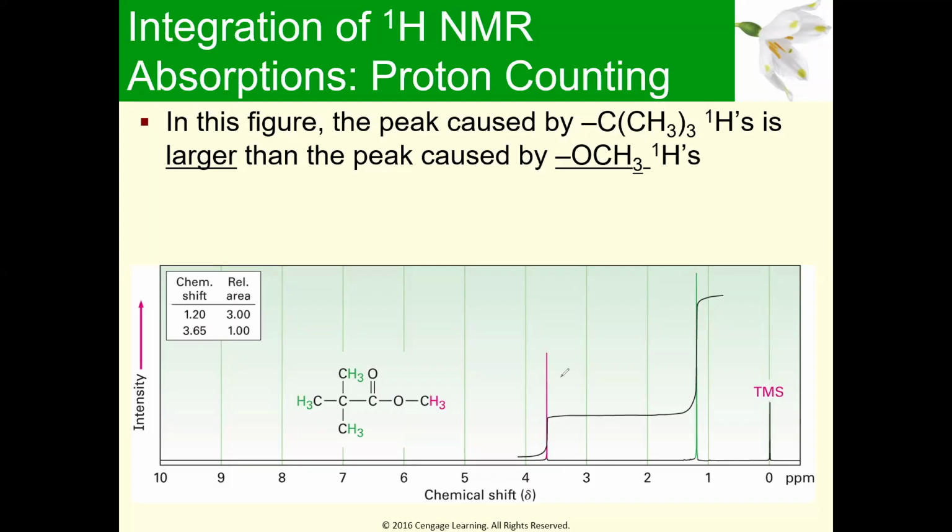With integration, all these look like real sharp, straight lines, right? But if we zoom in, we would see that it really is kind of like a curve. And so we could actually use, if you learned this in Calc 2, an integral. So we just figure out the area that's underneath that curve. Okay, so that's what integration is. All these peaks are really curves like this if we zoomed in, and the integration is the area underneath that curve.